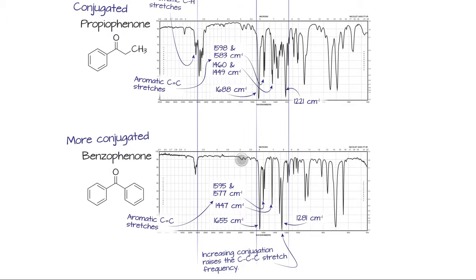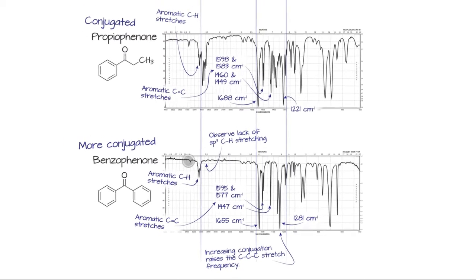And there's our overtone region, not as clear in the previous case. Often the overtone region is a little muddled, but there's, of course, our out-of-plane bending for the phenyl groups, which can be a little easier to help us identify exactly what's going on. Notice we have no alkane CH stretches here, so that certainly tells us that it's all alkene, or in this case, phenyl groups.